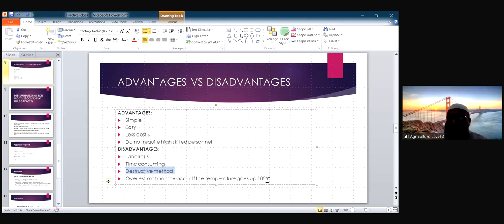Then the water content you will be measuring will be overestimated, because you have measured the loss of weight of water and at the same time the loss of weight of organic matter. So the water content you'll be getting will be kind of an overestimation. So you need to be very careful that you are not burning the soil out.